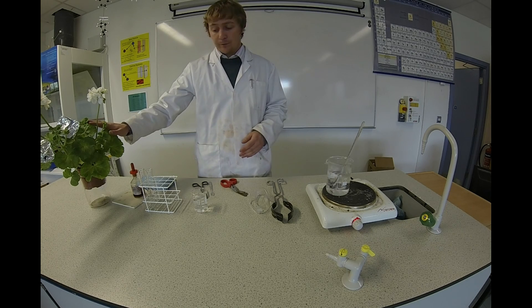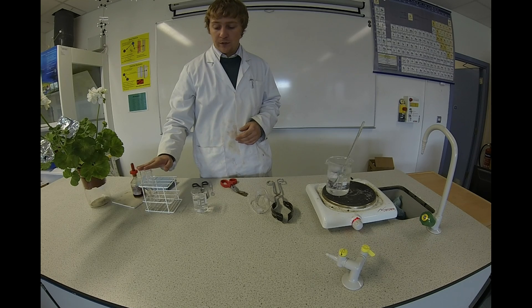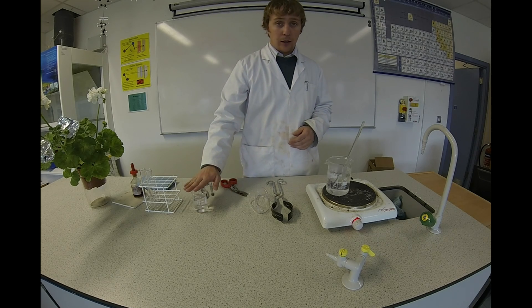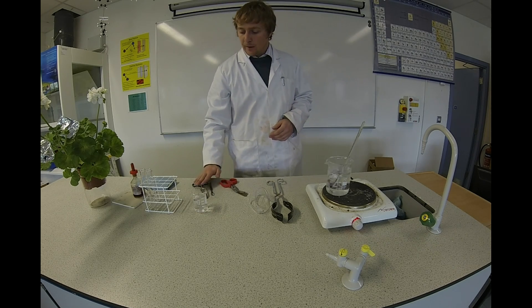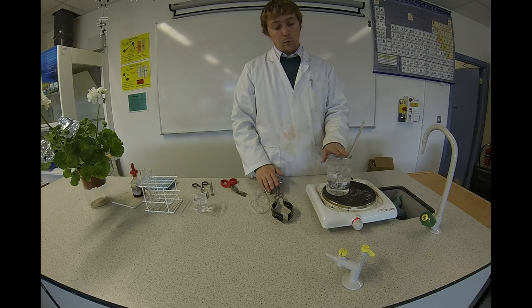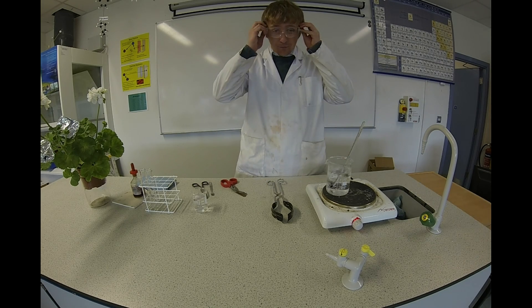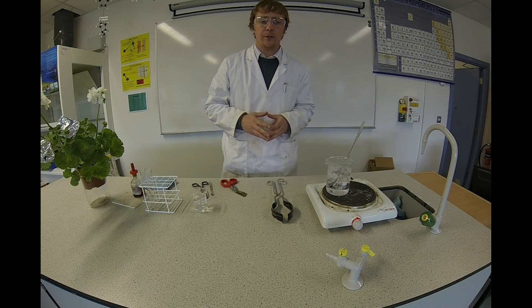For this we're going to need a plant, some iodine, a couple of test tubes, some alcohol, tweezers, scissors, and water boiling. Most importantly, you need your goggles on because you need your eyes to see the results.